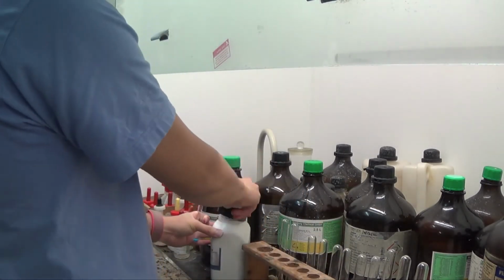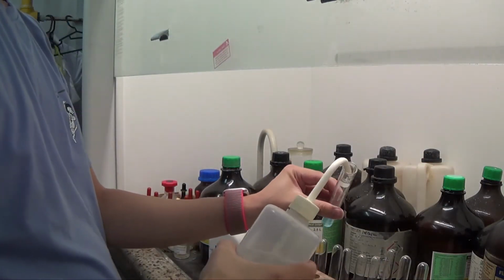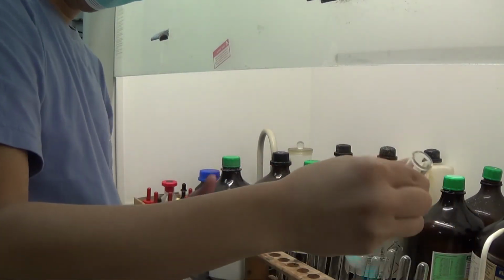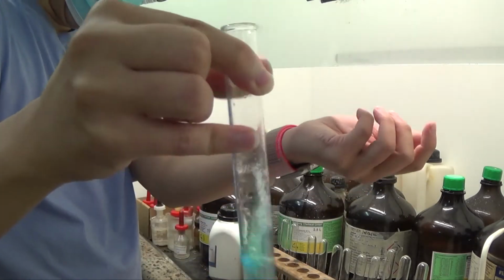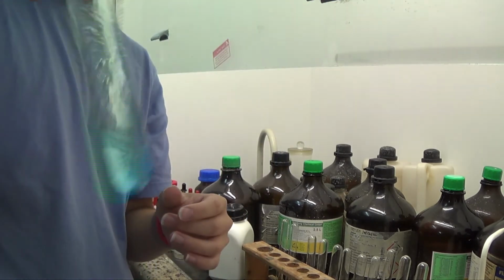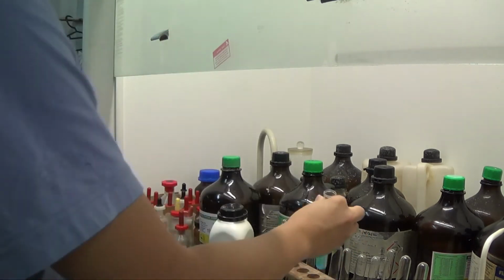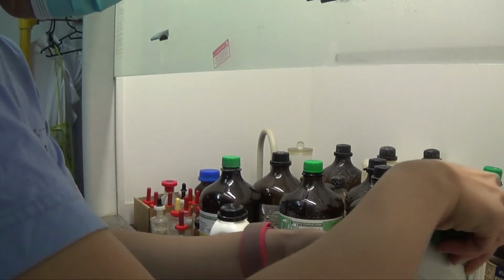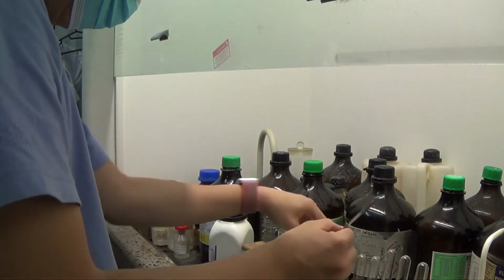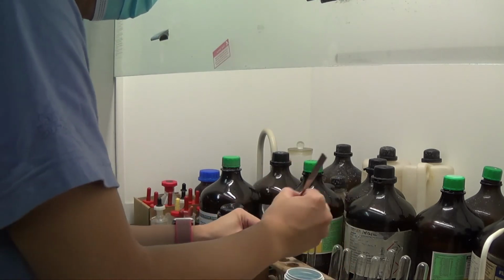It's a compound with water of crystallization. You could have heated it and driven off the water of crystallization as a colorless liquid forming on the upper part of the tube. Being a hydrated crystal, this is quite hard to dissolve. So I'll show you if I actually have the copper 2 sulfate anhydrous. This will be the slightly easier one to dissolve in water. That will give you the exact same result.